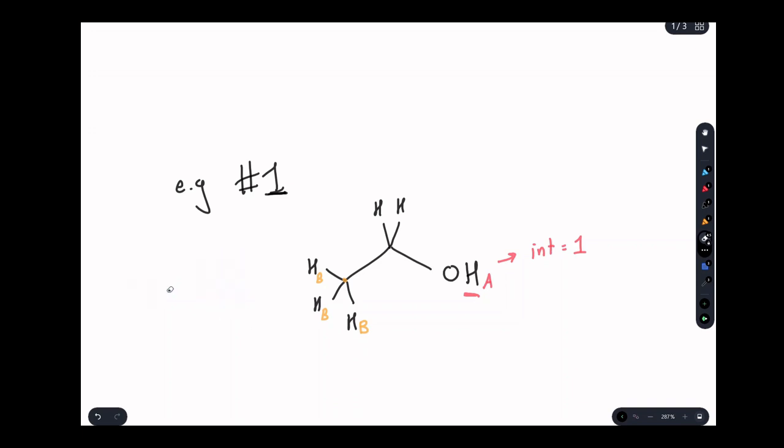So with that in mind, as a general rule, with many exceptions, as we'll talk about, hydrogens that are connected to the same carbon and that are able to rotate are very likely to be equivalent hydrogens. So here we have a 3 integration signal, as there are 3 hydrogens in that group. And following that same trend, since these 2 hydrogens are connected to the same carbon, we would expect them to be similar by rotation as well. That would be an integration of 2 signal.